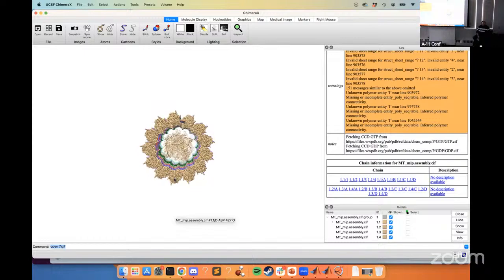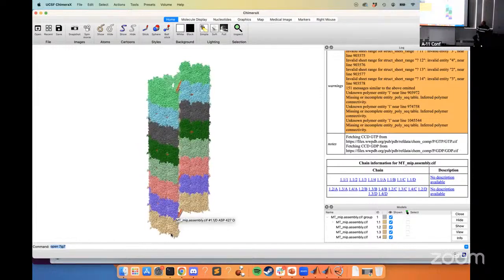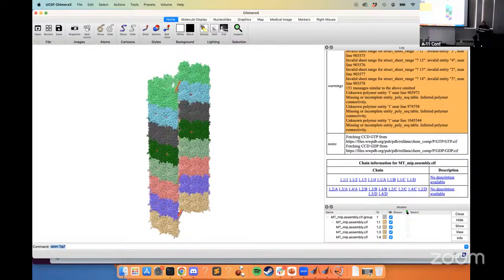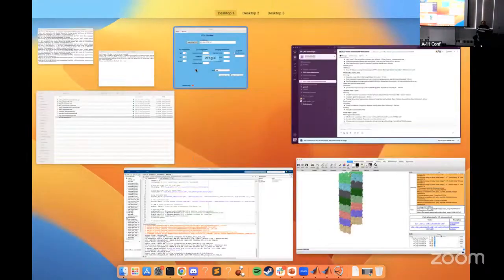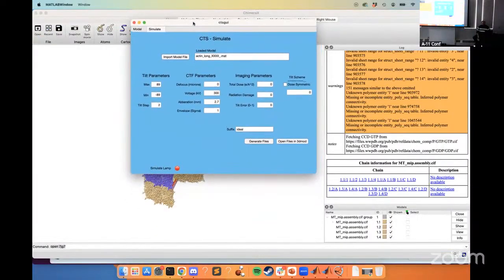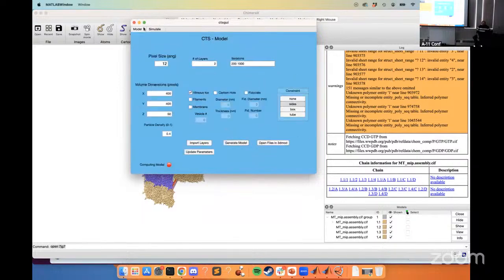I definitely want to do some longer stuff. There's a filament generator part of the model. It's partially supported, and that will allow you to place actual helical microtubules and other filaments at whatever length fits. I didn't really go over it.